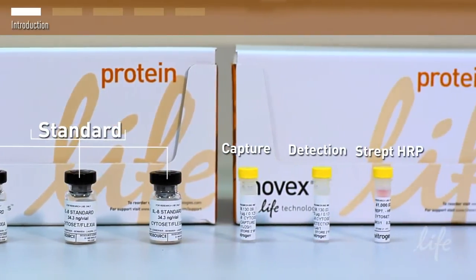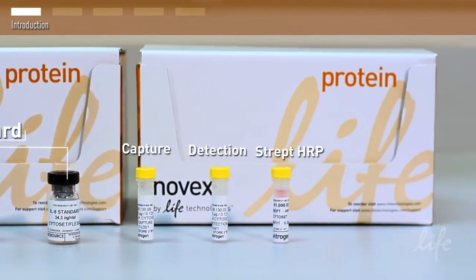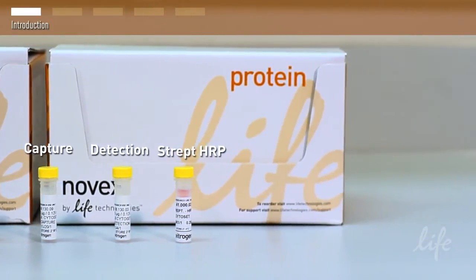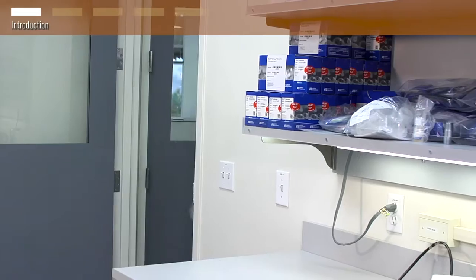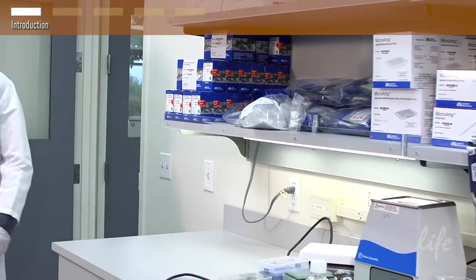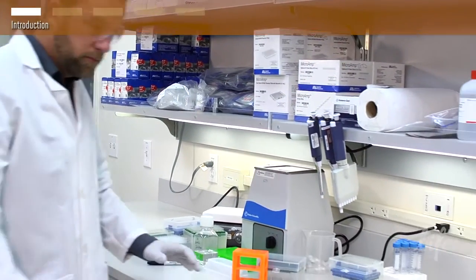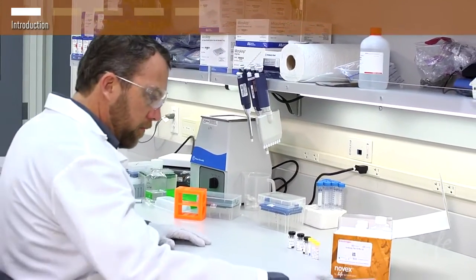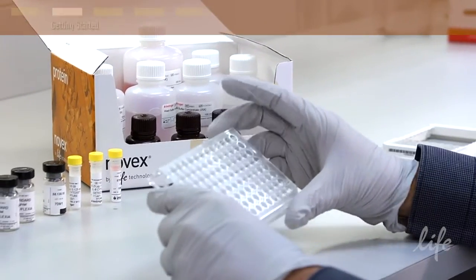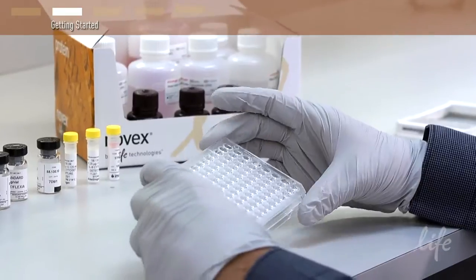Additional materials not supplied in the kit are microtiter plates, tubes and pipettes. It is important to note before beginning that some protocols differ from the one presented here. Please read and review your protocol carefully before beginning the procedure.